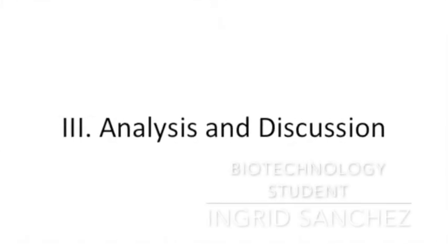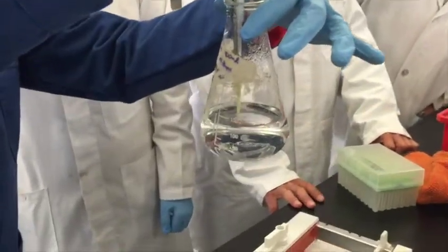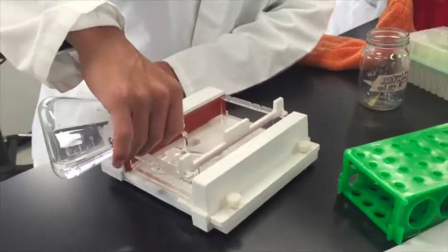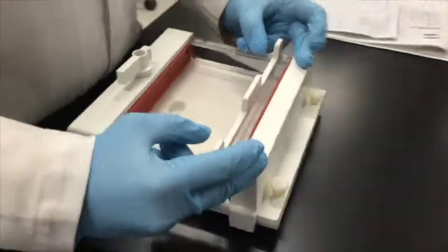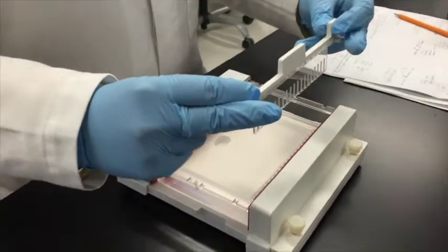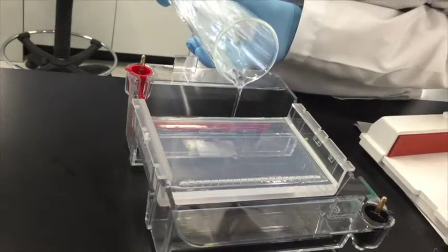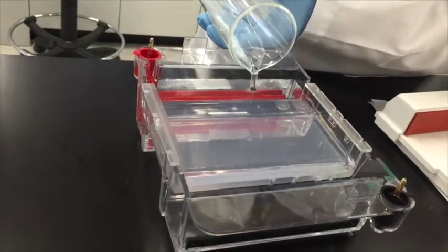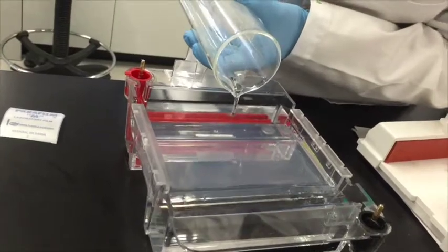When running an electrophoresis, it's important for us to know the percentage of agarose or polyacrylamide we're going to need. This is because depending on the size of the DNA is the percentage of the matrix we're going to use. It's also important to know the quality of the DNA extracted and that we are observing in the gel. Through electrophoresis, we can know the concentration and integrity of the DNA, and we can also know the size of the fragment of DNA. Through electrophoresis, we can separate the biomolecule through a matrix, whose function is to be a filter for the molecule to be separated.